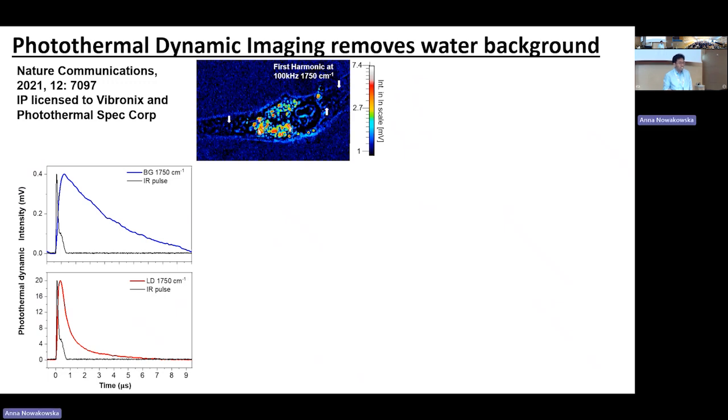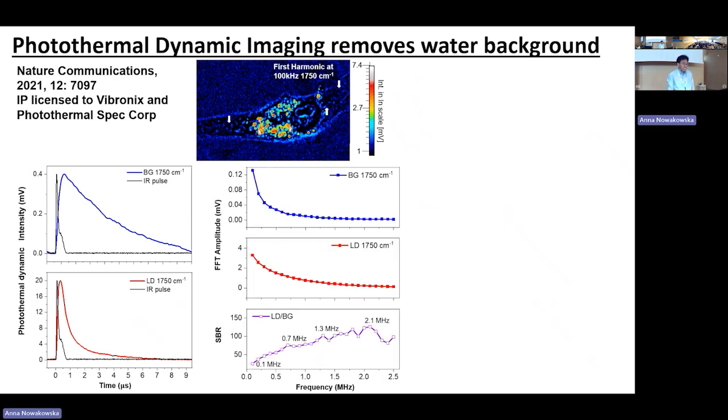And if we convert into this time domain, the photothermal process is slow, so you can use one photodiode with the digitization card to do this measurement. That's without lock-in. And in the frequency domain, the fast dynamics means you have high harmonic signals. So instead of using the fundamental signal, you can use high harmonics to do the measurement.